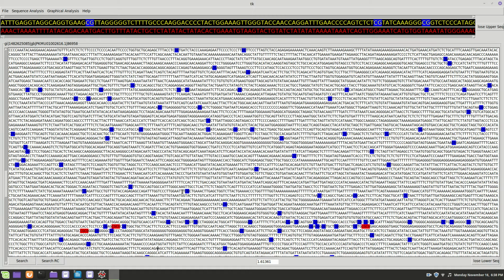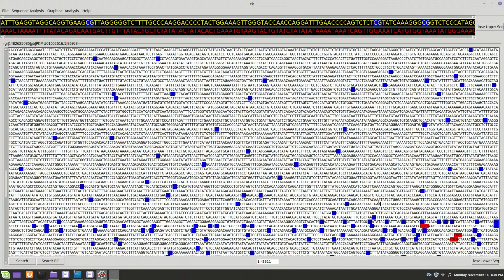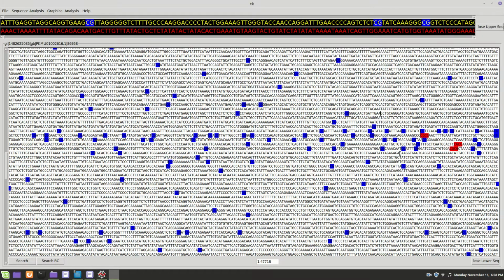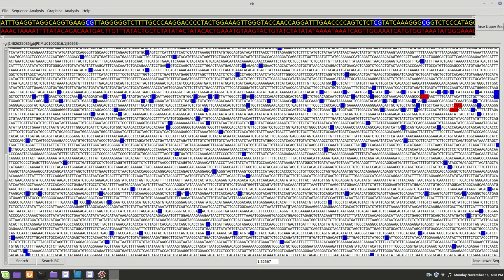The next one, you don't know where to stop. Now, it can't be too far down, but a couple of thousand, 5,000 at the most, I would say, down past here. So it's not going to go much further than right in here. But you'll have to find it, I suspect. Let's see if I can see some T's. That looks like a termination signal right there. Could be here. Could be there.